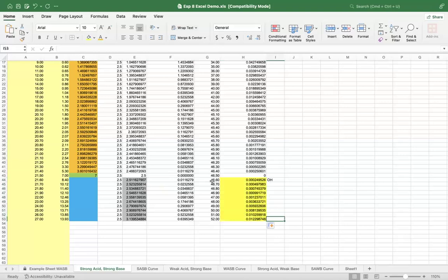I think I said I was going to do one and I did the other. But either way, that's why I had highlighted this area, just so I could visually see where I want to maybe flip the sign or subtract differently. I hope you understand that that's what we were dealing with in these numbers here. These were the excess moles of base.